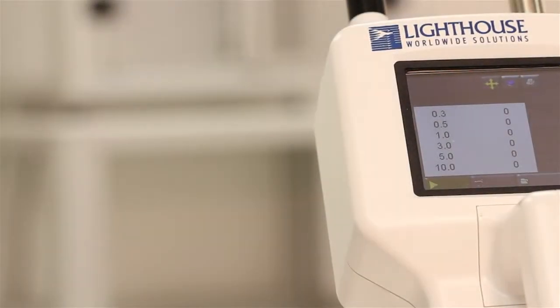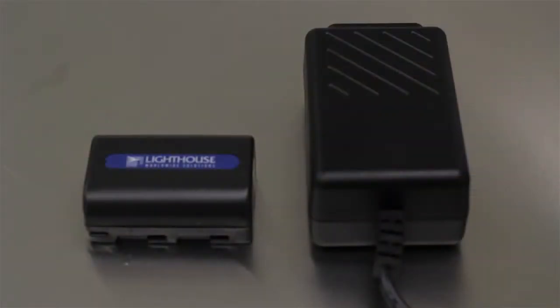The Lighthouse handheld 3016 particle counter can be powered either by the included lithium-ion battery or 12-volt power supply. The battery is inserted into the bottom of the unit.